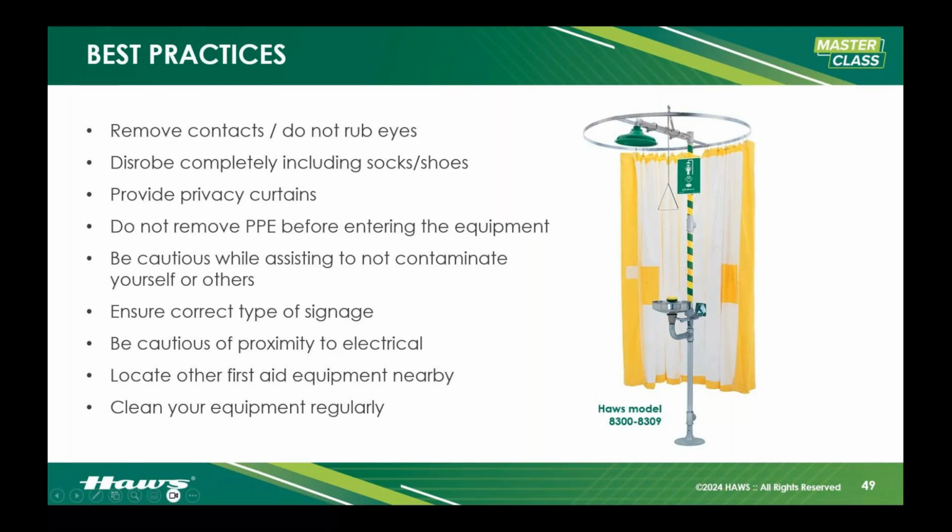Do not remove your PPE before entering the equipment. Immediately run to the emergency equipment, get into the shower, activate it, and then start to disrobe. The reasoning for this is that as you have goggles on, you want the water hitting those and already active when you are removing those.